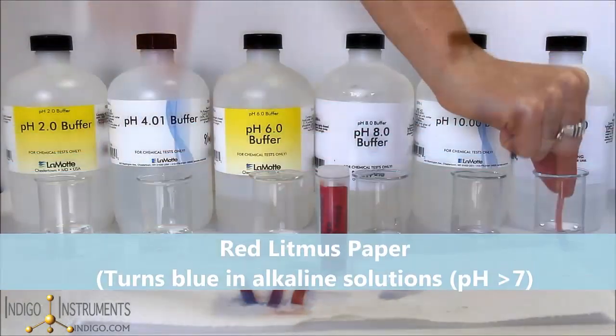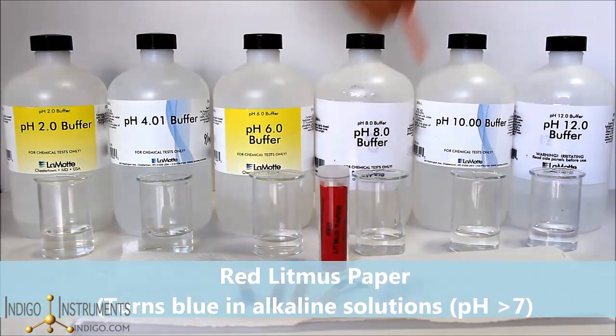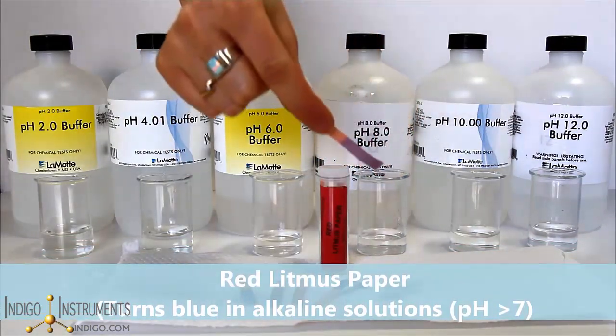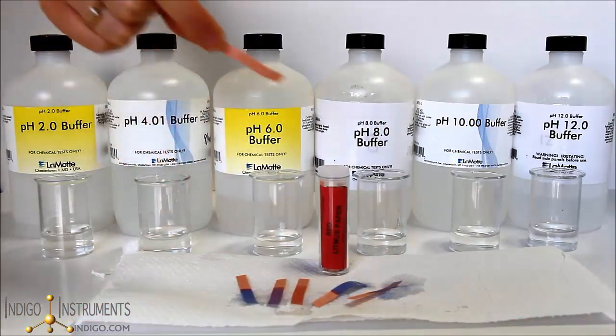A red litmus strip dipped into solutions ranging from pH 7.1 to 14 turns blue, indicating the solutions are alkaline or basic. If you need to know how acidic or how basic these solutions are, you will need to use pH test strips.